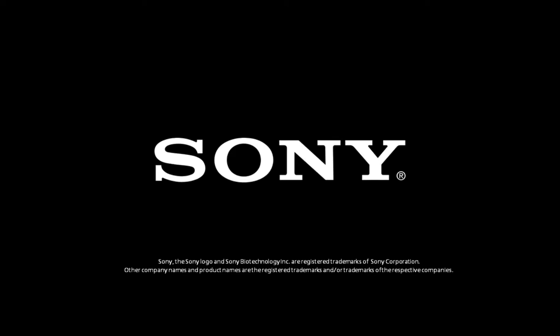Okay, thank you, Dr. Soni. Our next question, how does the Sony MA900 address biosafety level when sorting human cells or cell lines? Would these cells be categorized as BSL2 or BSL2 plus?